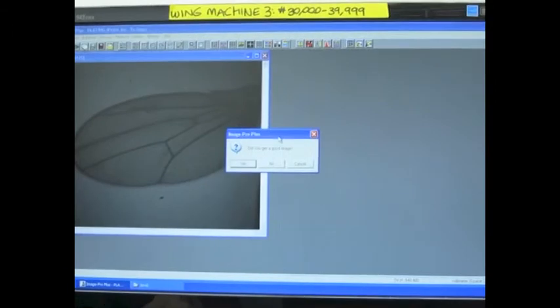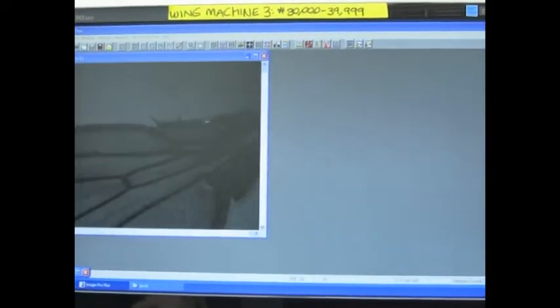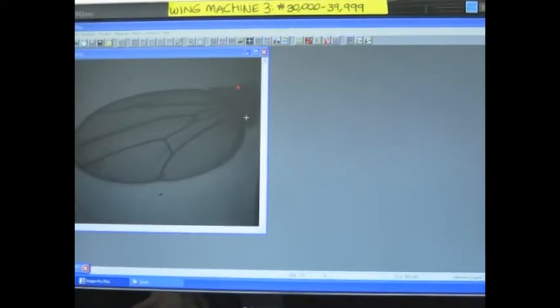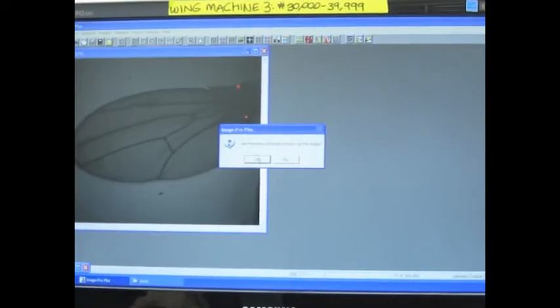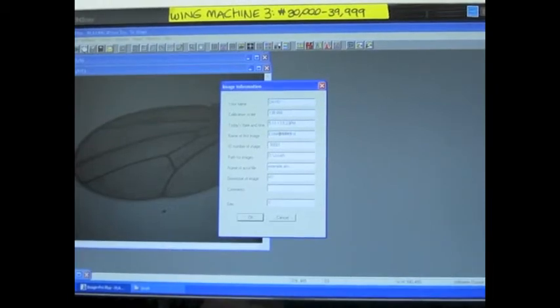Once you've taken a good picture, click continue to record the image. Our imaging program then asks the user to mark the position of two starting points on the wing. After the points have been marked, you can enter any important information about your slide.